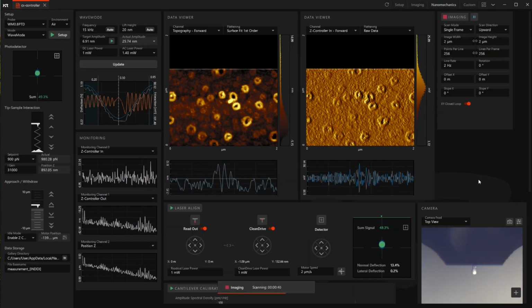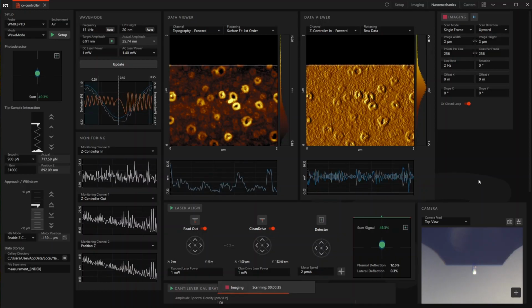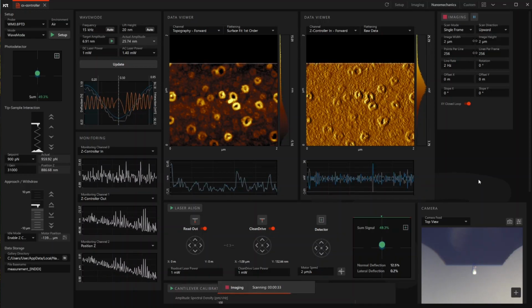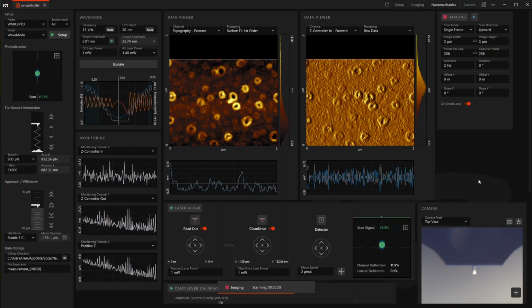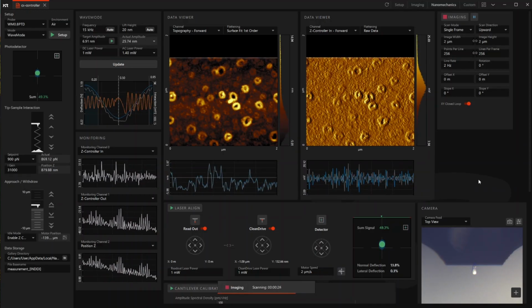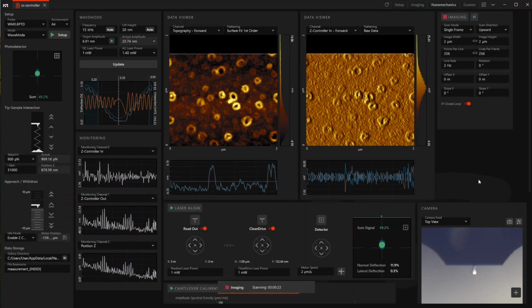This probably has to do with the ordering on the silica glass and the amount of ions, but I don't have any data to support this. It's just based on very small experimental evidence.